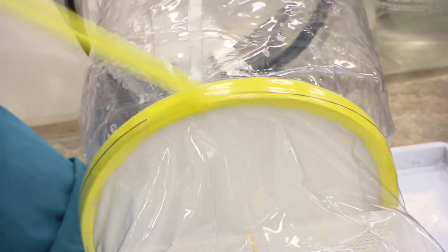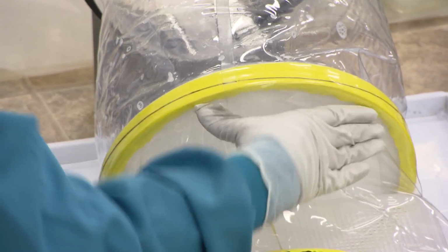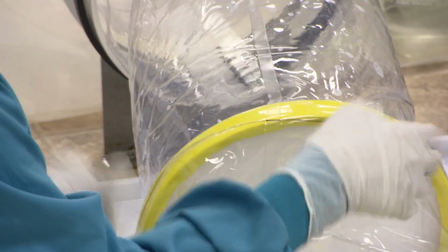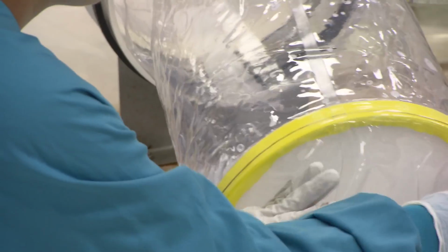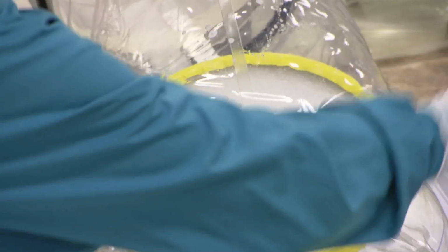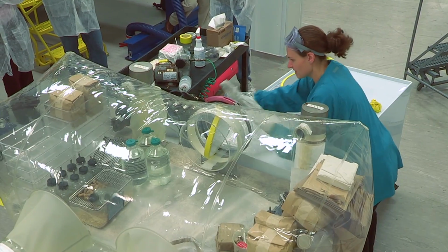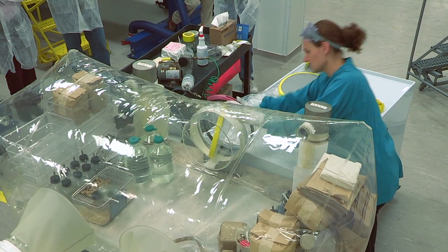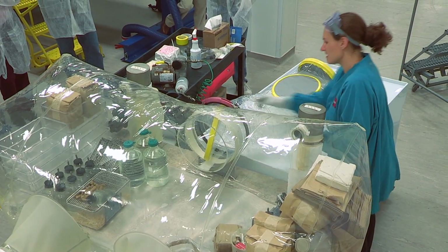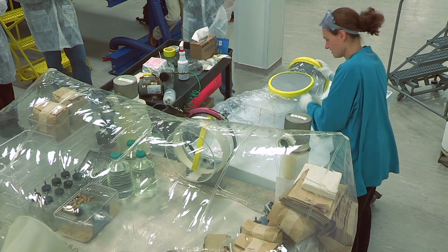Many wraps of tape. Okay. Go. And sometimes, there we go, that went in nice and easy. Sometimes you might put a little dig in the tape, but that's okay.